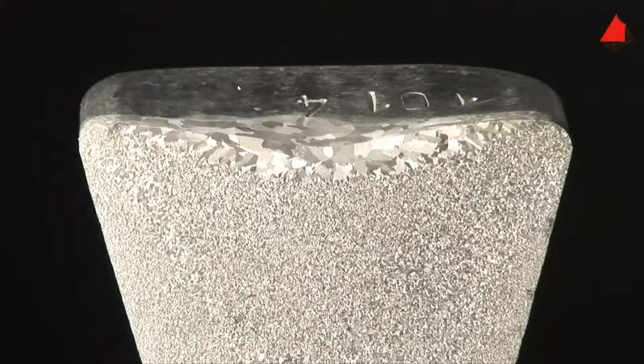Okay, so this is what I was telling when I said macroscopic analysis. The way in which she has prepared the surface, the crystals are visible even without any microscope, right? Magnifying lens, nothing was required. Just by the naked eye, we could see this crystal structure, a rough crystal structure. We get an idea. Okay, so let's move ahead.